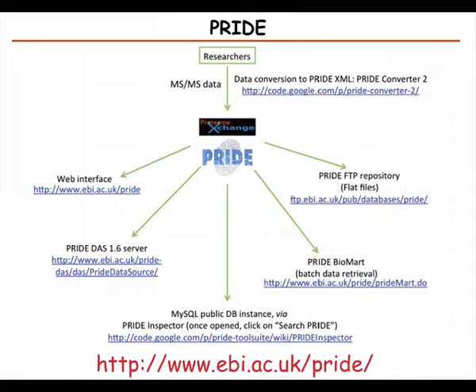And so what happened with PRIDE is that it was actually for a long time very complicated to submit something. They required a lot of metadata, which is great to have afterwards, but it really made it a big barrier for most labs to deposit their data. So then they came up with a more simplified format with just really the necessary information to be able to make sense of the data. And I think now they also provided better tools to do the submission and description of data. So now it's used a lot.